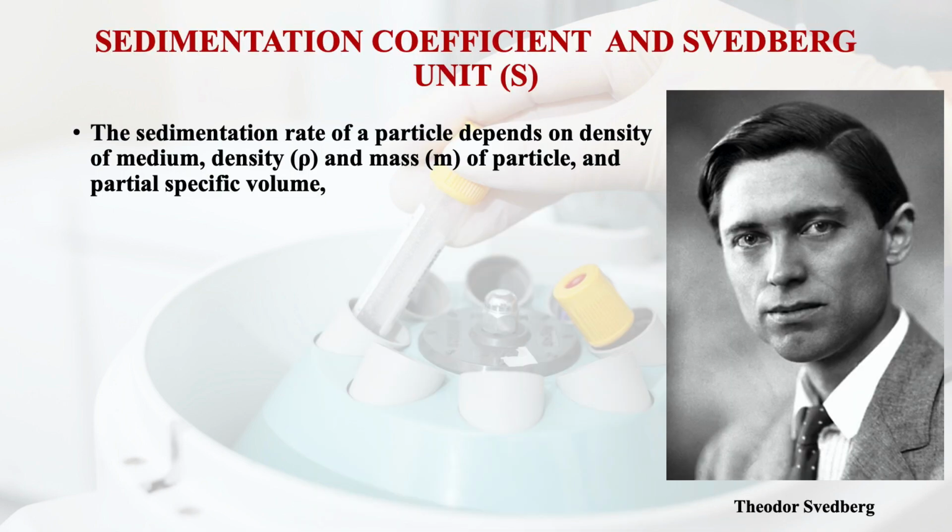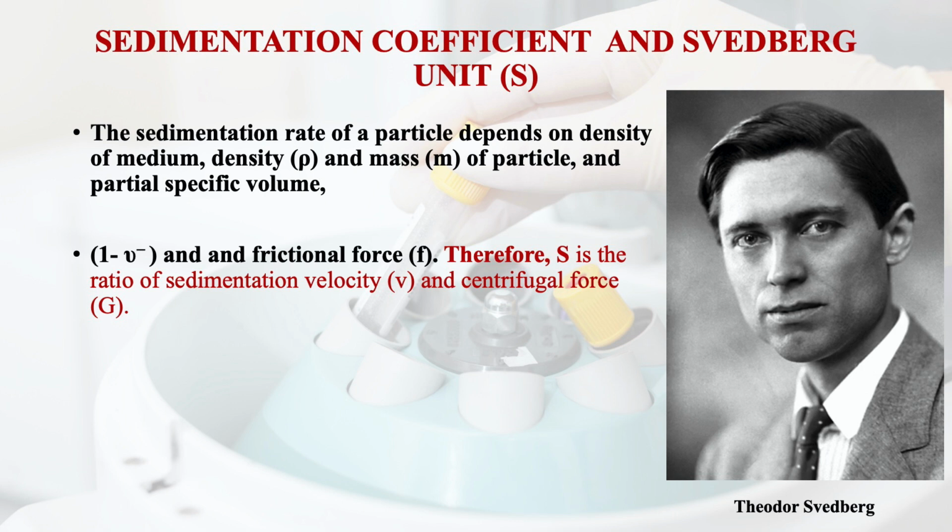The sedimentation rate of a particle depends on various factors such as the density of the medium, the density and mass of the particle, the partial specific volume, and the frictional force. When particles move in a circular direction, they experience the frictional force generated by the liquid medium. So frictional force is considered here in the equation.